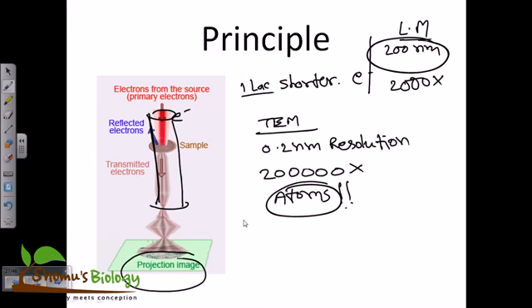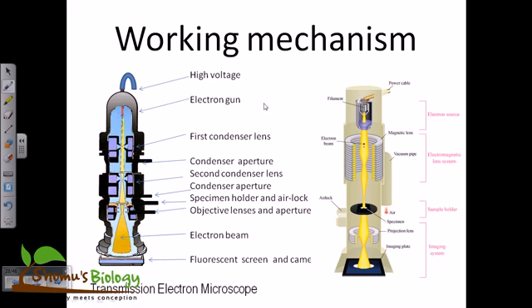In this case, not actually transmission, with the help of electron microscopy, though there are different types of electron microscopy that we should use in that case, we can actually use electron microscopy for that. But in TEM, we can receive this higher resolution power as well as a high magnification power. So better magnification with better resolution, obviously the first choice for us to start looking at very thin structures of the cell, right?